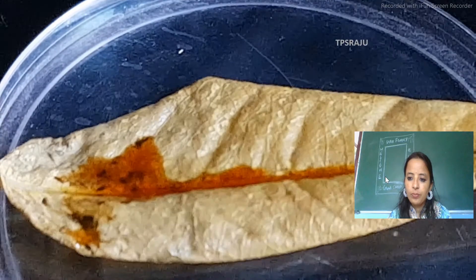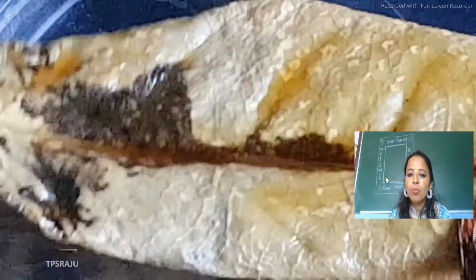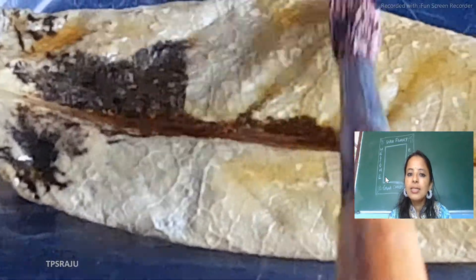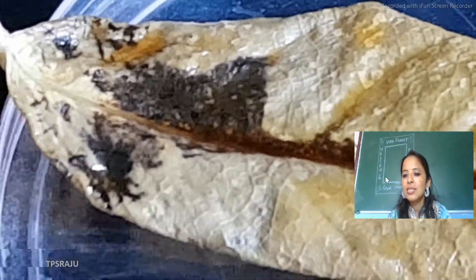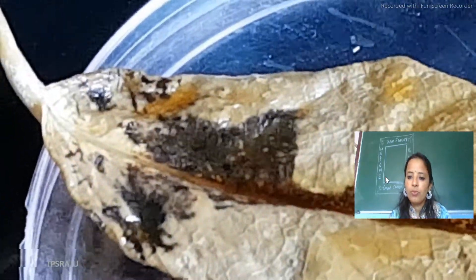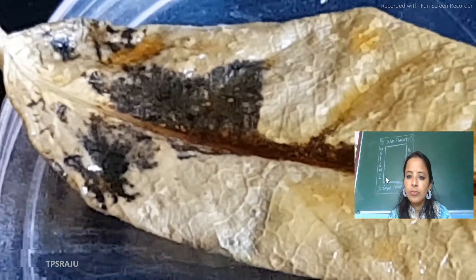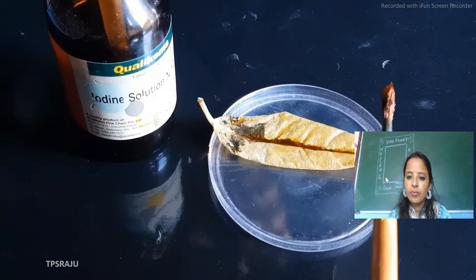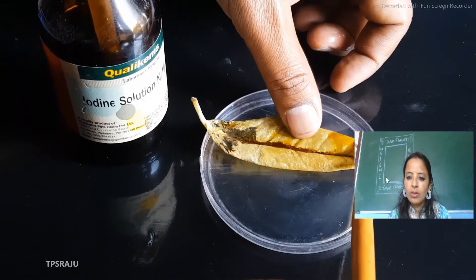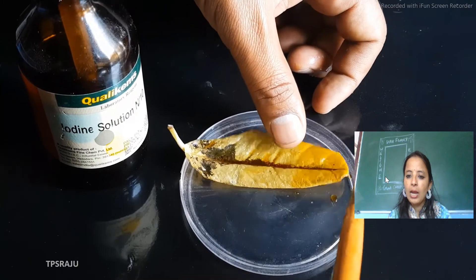And what will we see? Students, we will see that in a certain portion there is a dark color and in a certain portion it is simply the yellow portion. Just observe it — I am applying iodine now.